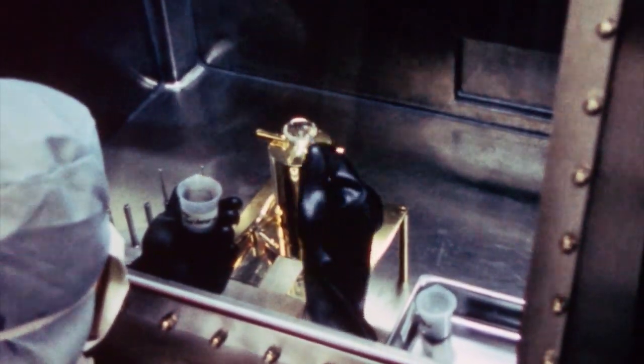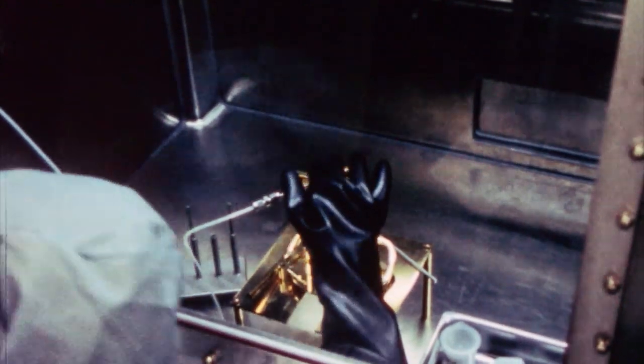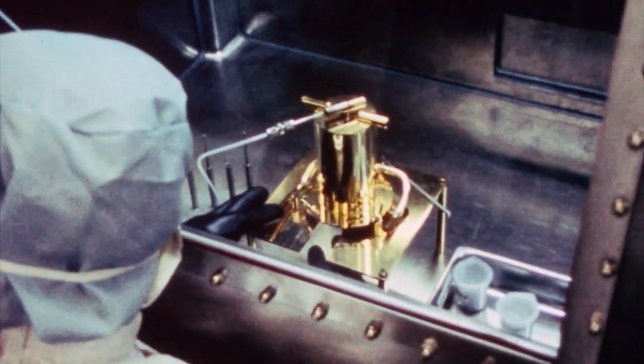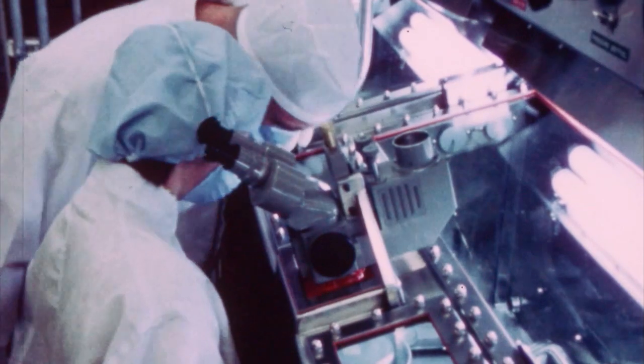You would dump the sample in, and it falls onto a disk right underneath where the funnel is. Then you see them attach a hose — that hose is high-pressure gas — which scatters it so you get a more uniform distribution of the lunar sample over the surface of the Petri dish.